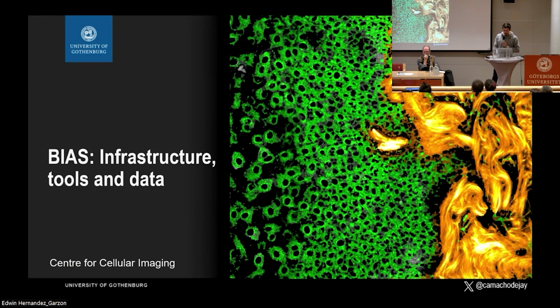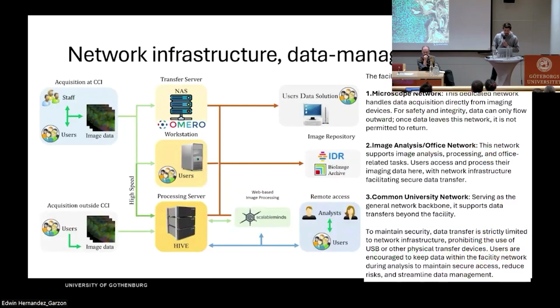So now, given the scope of the facility, with all of these different microscopy modalities, the question is, how are we handling the data? I think if we're going to talk about image analysis, we also need to talk a little bit about data management, and how the data flows within the facility. That's the first thing that I wanted to try to describe to you.